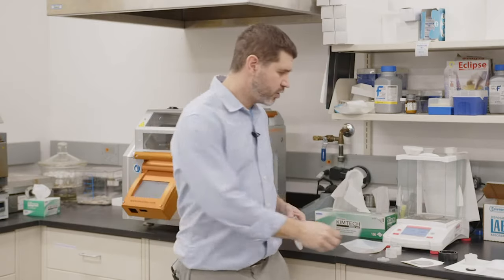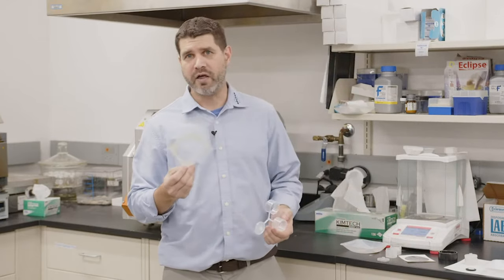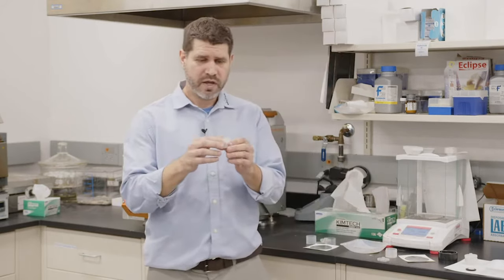Now, if you were going to run a sample like a liquid or a loose powder, you're going to use a plastic assembly that you see here, and you're also going to use some sort of film, like Prolene or Mylar, but there's a lot of other options that are out there. When you assemble it, you get a cup that looks like this, and then you pour your liquid sample in there or pour your loose powder sample in there, and we run the sample just as this.